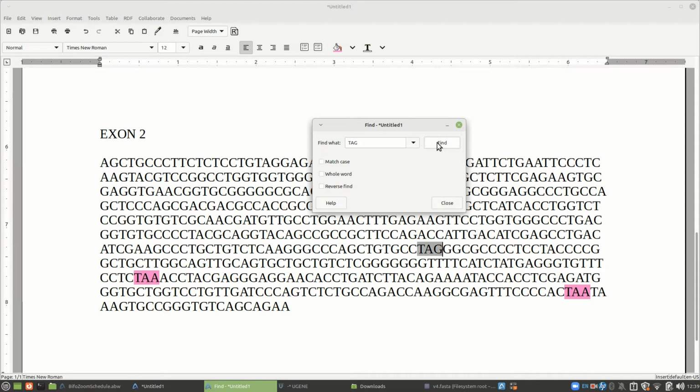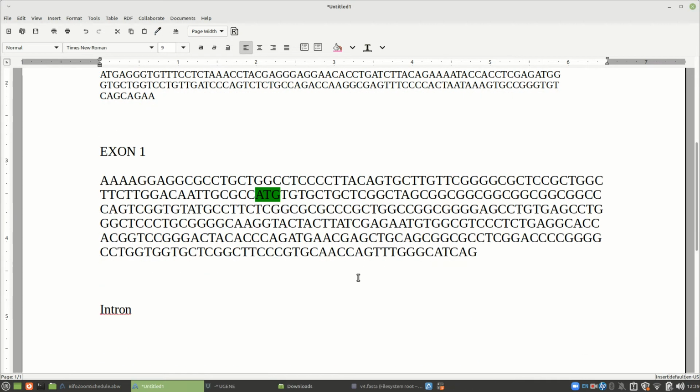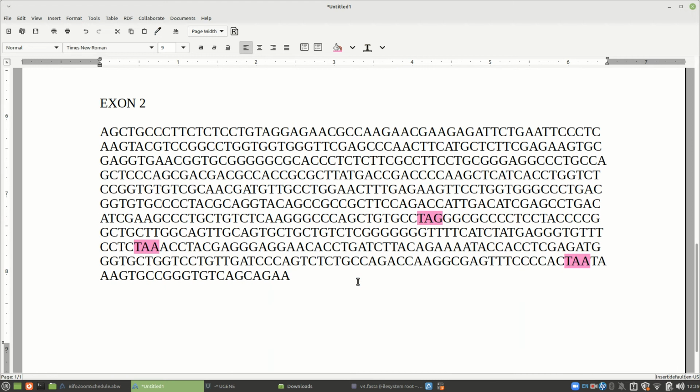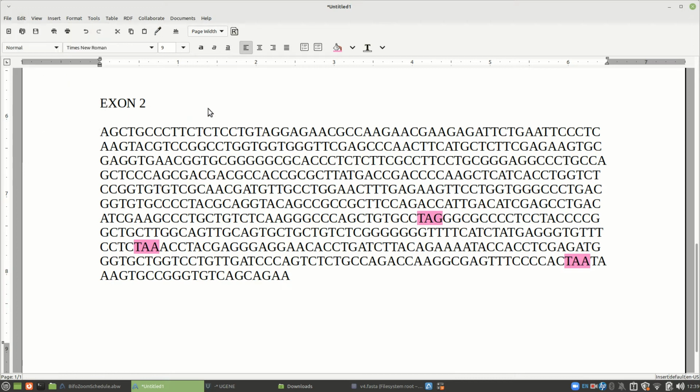Well, because I think now this one could be. It's late enough. Who knows? It's past halfway. All right. And find the next, and then we're back up there. So, okay, we've got three potential stop codons now. Let's go and see how we might do the last one. So, again, I'm going to click down here. Now, we had one we skipped. Who knows? It could be. If it's in the reading frame, that might have been it. And I may make a mistake.